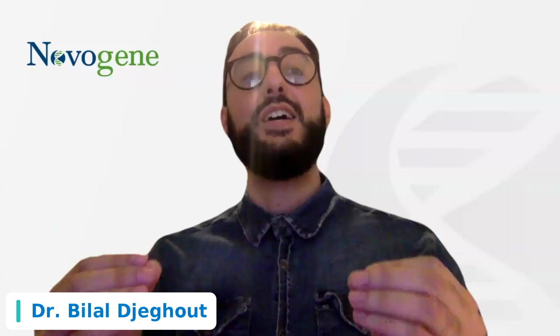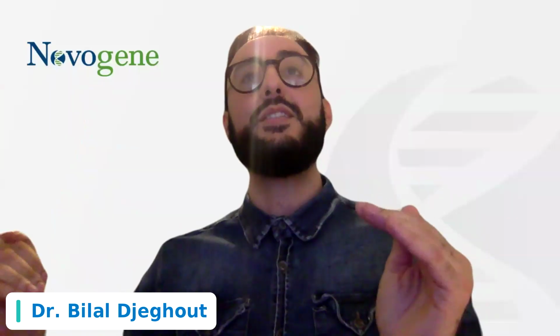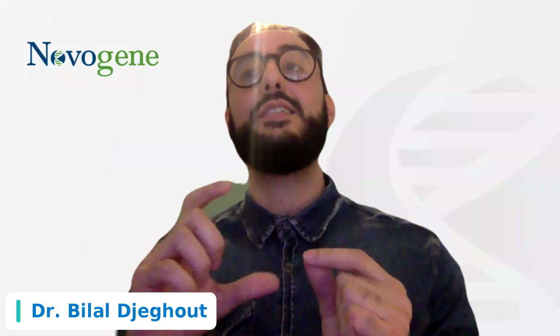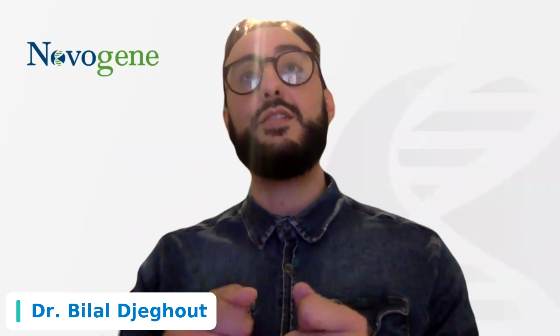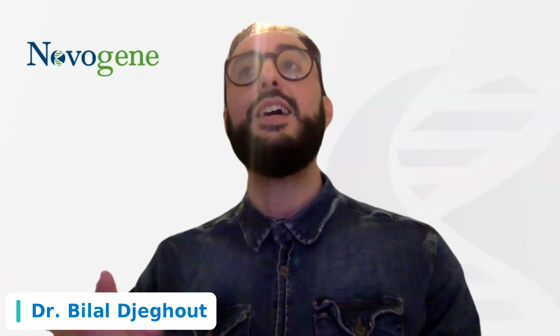When you think about it, if you have fewer other bacteria and more Campylobacter, even in tiny amounts, the percentage of Campylobacter is higher than in the unfiltered sample.